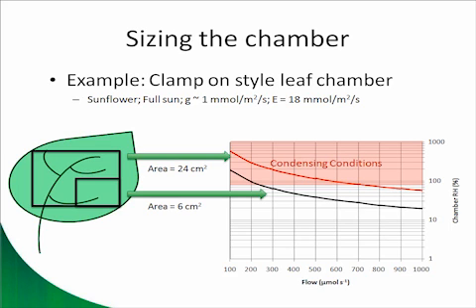Now, the point here is not to say that large leaf area chambers can't be used with the LI-6400, as we have plenty of customers that do this. But it's to illustrate that physics and the measurement desired impose limits on what we can do, which prevents there from being a one-size-fits-all chamber solution. So think about what you want to measure before you start building the chamber.